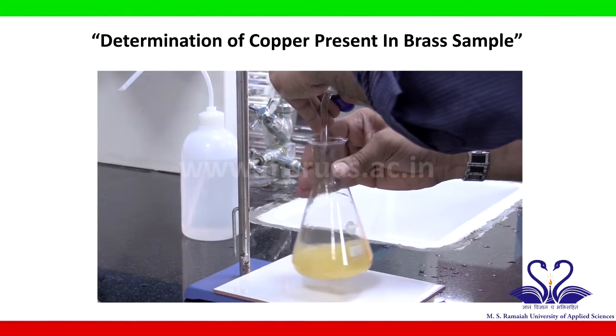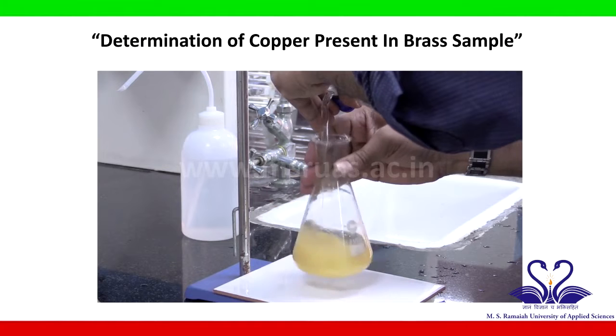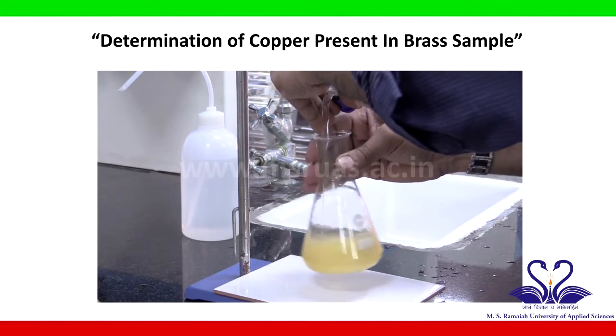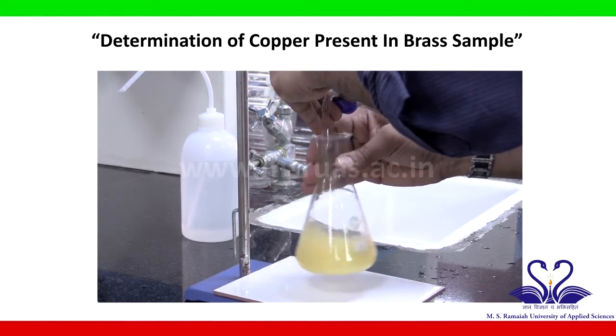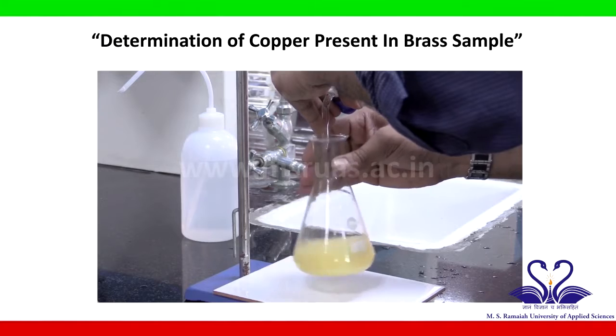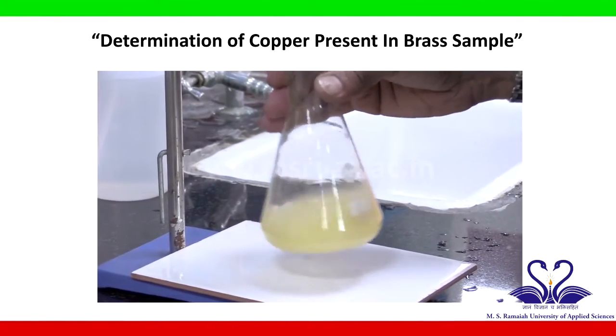You can see it is becoming lighter. Now it is light yellow. It should become pale yellow.